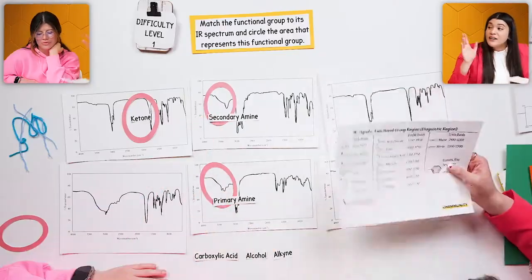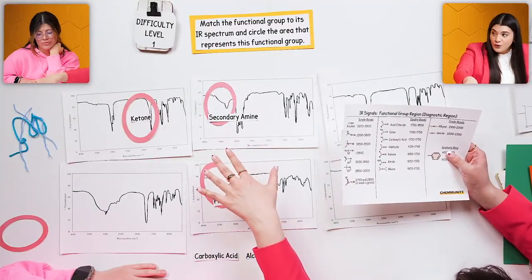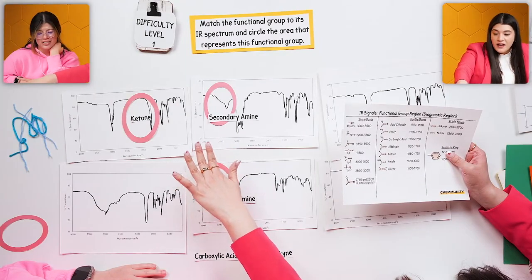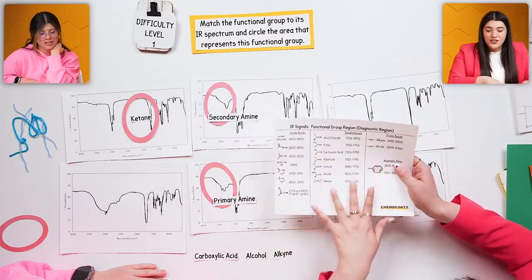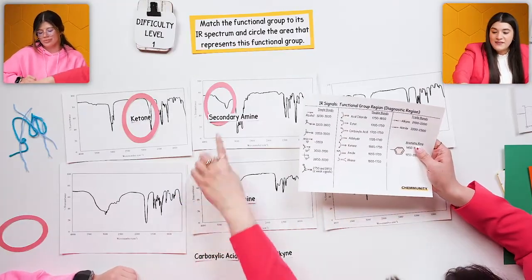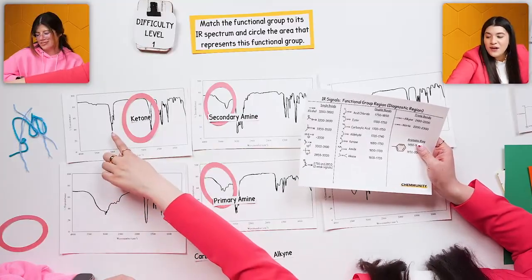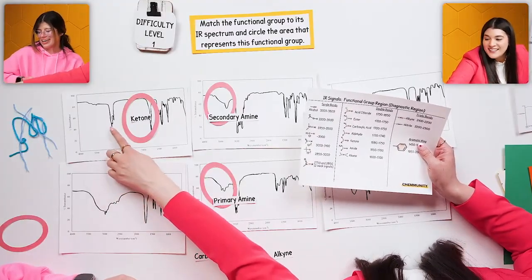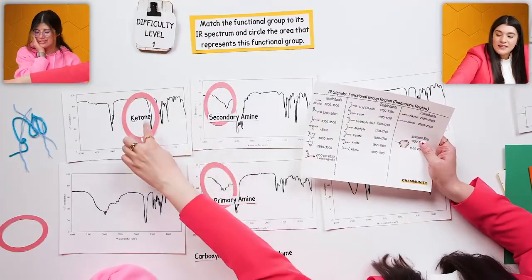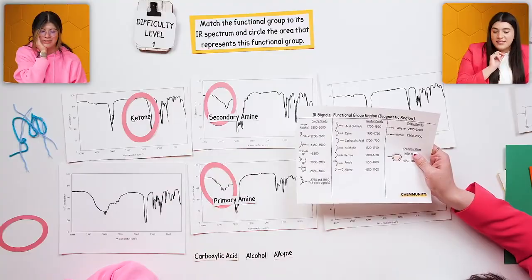Now, the first thing you want to do with these types of questions is look at the functional group region, which we said was greater than 1400. Then you look at what it could possibly be, and whether there's a specific peak feature, so you're not tricked by something that's just sp3 hybridized. Whenever we see something within its own range, we can figure out what type it is.